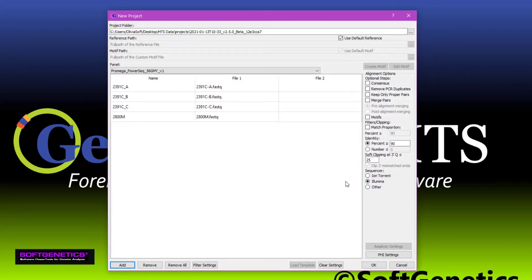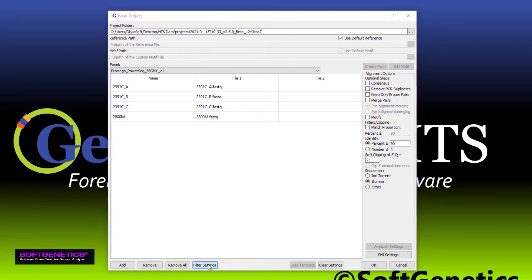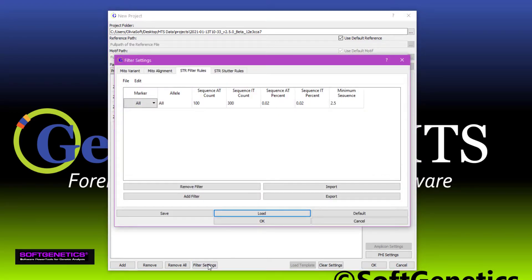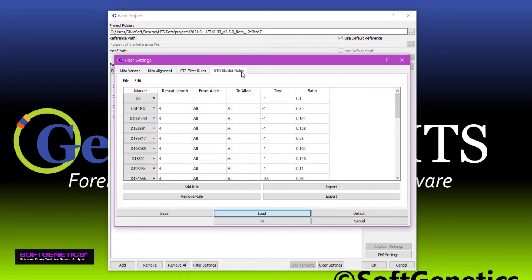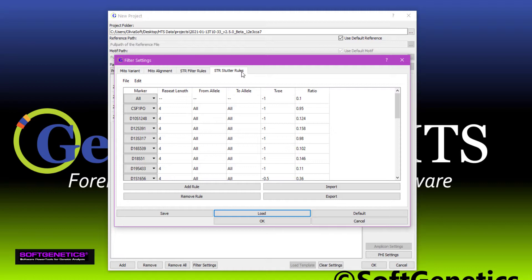Down at the bottom are filter settings for both STR and MITO analysis. The STR filter rules tab allows you to set marker or allele specific analytical and interpretational thresholds. The STR stutter rules tab allows for the input of marker or allele specific stutter settings, including plus one, minus one, and complex stutter. These settings can then be saved for routine use.